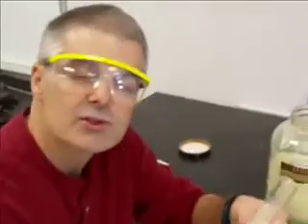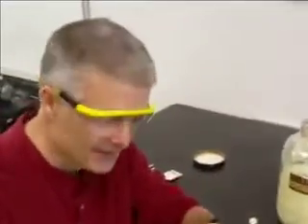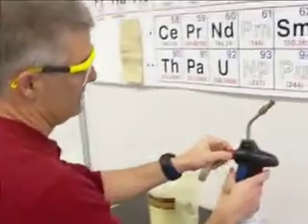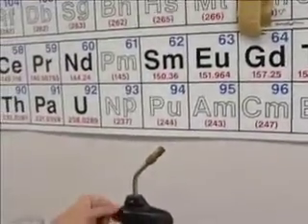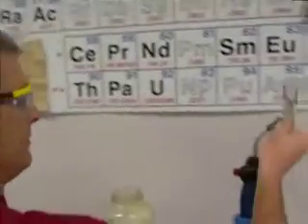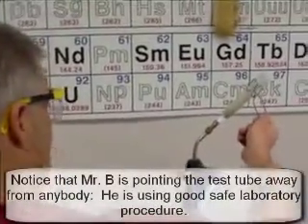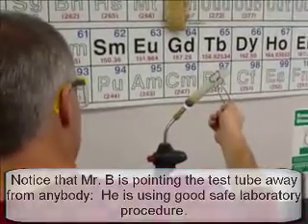So they have not reacted. So to get them to react, what do we probably need? Heat it up. We need some heat. So fire. All right, let me move things around for a moment. Okay. So we have our torch. Turn the gas on. Torch. So now I'm going to heat them up, pointing it away from people, not towards Mr. Sams, even though I might want to.